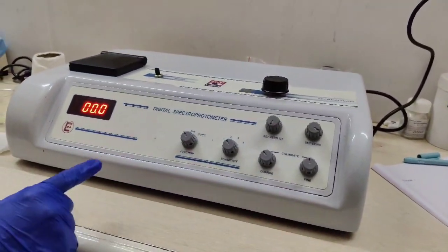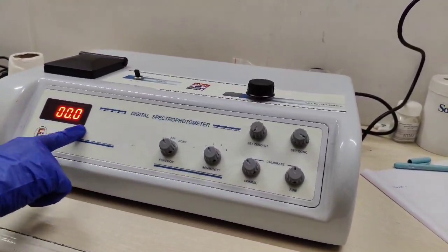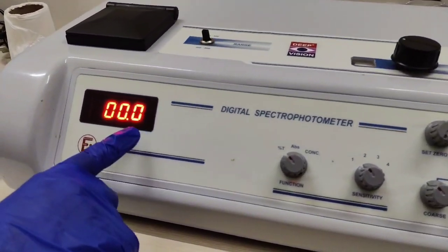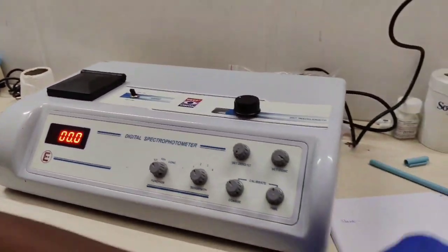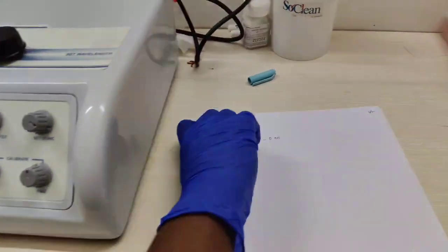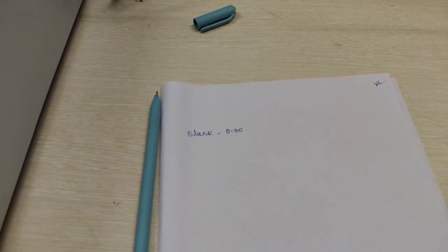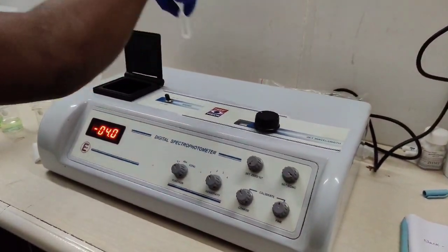Fill the cuvette with distilled water, set 0.0, that is the blank. Open the lid, put the cuvette in the spectrophotometer, then close the lid.